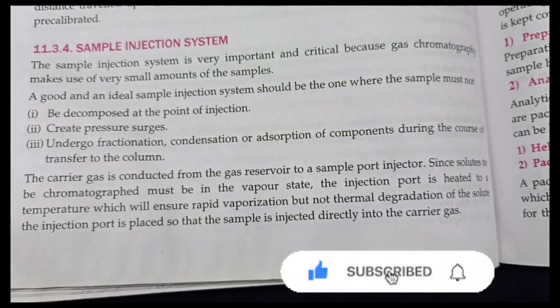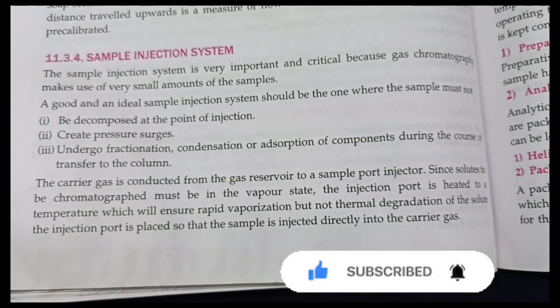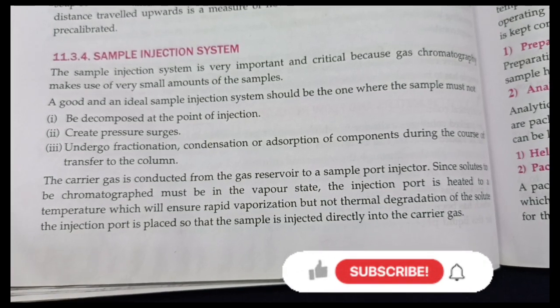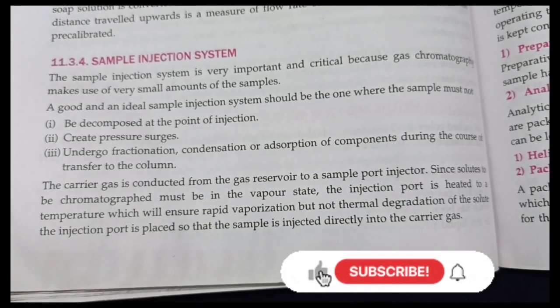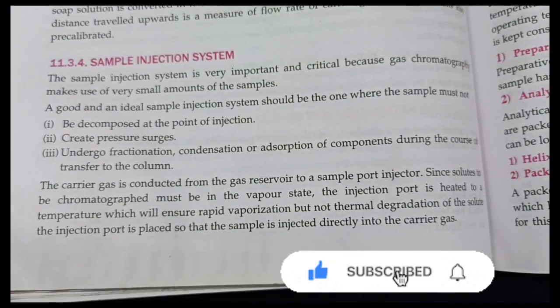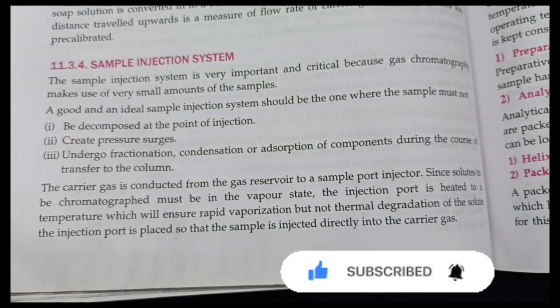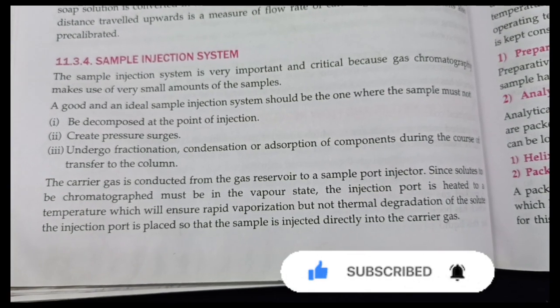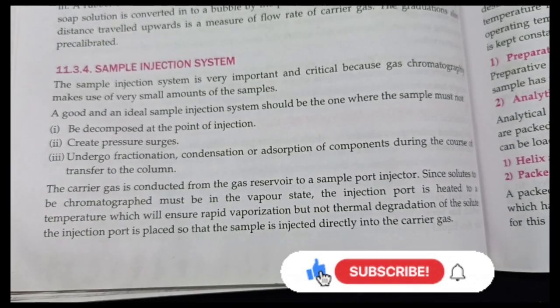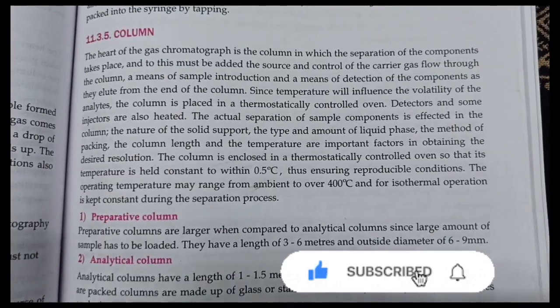The carrier gas is conducted from the gas reservoir to the sample injector port. Since the solutes to be chromatographed must be in the vapor state, the injector port is heated to a temperature which will ensure rapid vaporization but not thermal degradation of the solute. The injection port is placed so that the sample is injected directly into the carrier gas.